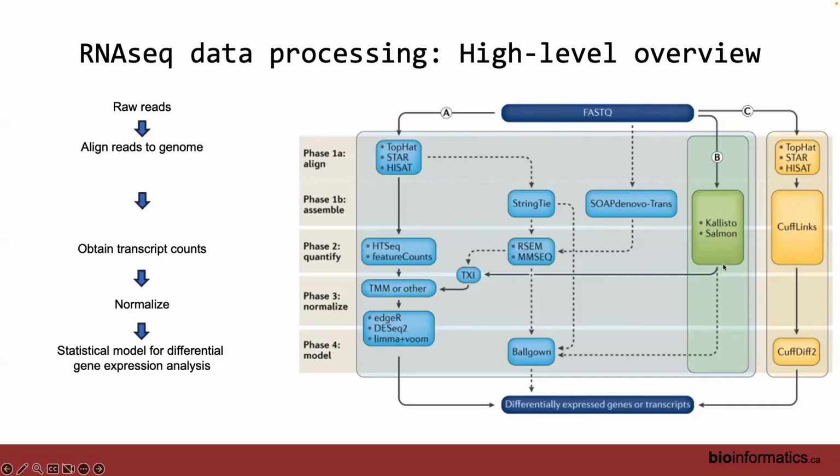So from a practical perspective, you just need to ask them, did you use standard parameters when you aligned it? Or did you change something? Did you tweak something? Did you make it very sensitive to alignment? Or did you just use the default parameters, right? And then you might want to consider, if they changed the default parameters, why did they? Does it have to do with your application? Like, oh, for our data, we have to change the parameters for XYZ. It necessitated it, right? Those two things.